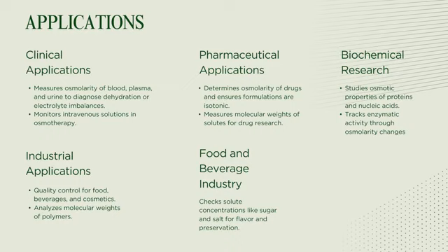It is used in critical care to monitor the osmolarity of solutions administered to patients, ensuring they are safe for intravenous use. It determines the osmolarity of injectable drugs, eye drops, and other medications to ensure they are isotonic and safe for human use. It is used to determine the molecular weights of polymers, peptides, and small molecules in pharmaceutical research. It provides information about the stability of formulations by measuring changes in osmotic concentration over time.